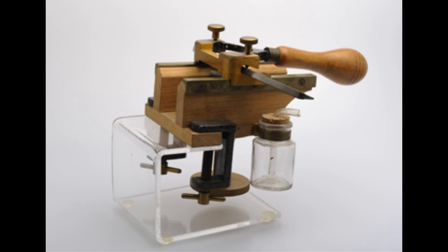A microtome is an instrument that allows for specimens, such as tissue samples, to be sliced thinly so that they can be viewed as a slide under the microscope. The most common way of preparing samples traditionally was by embedding the tissue in molten paraffin wax. When it had set, these could then be sliced.